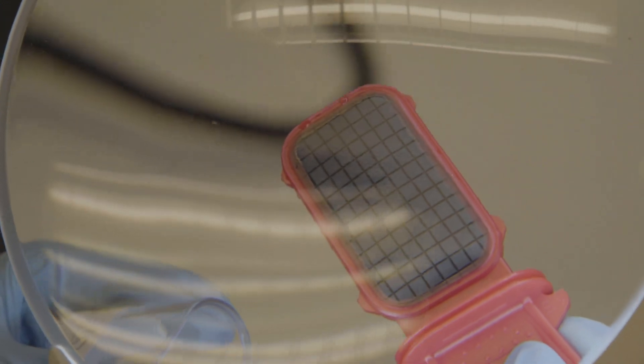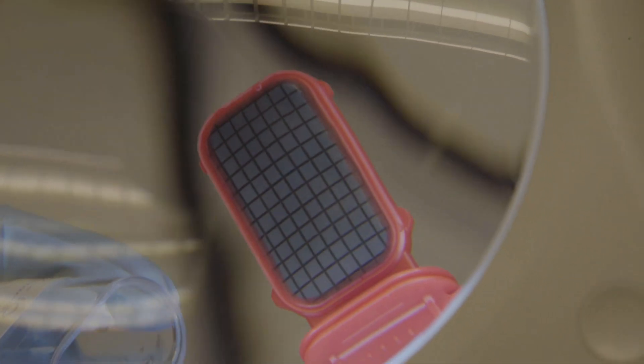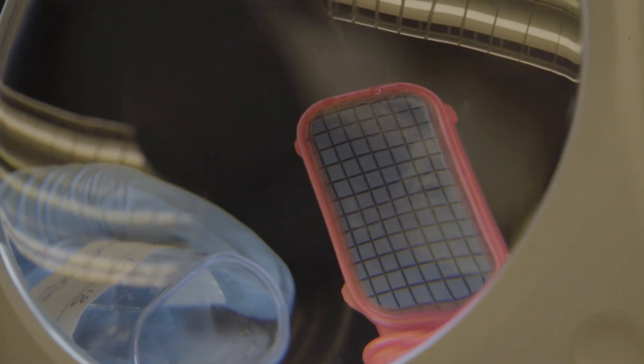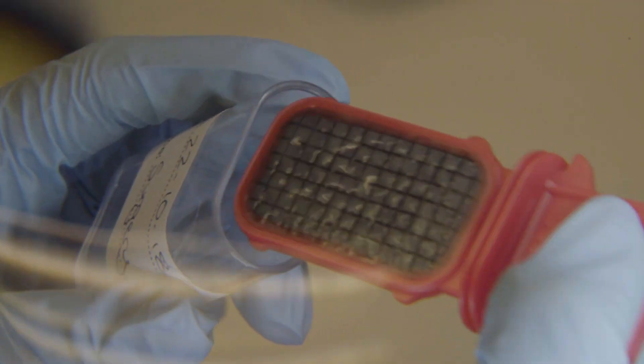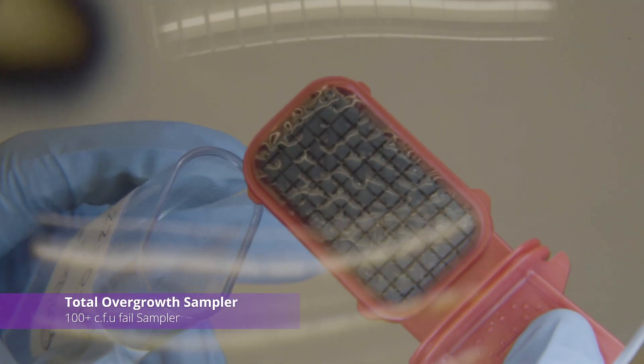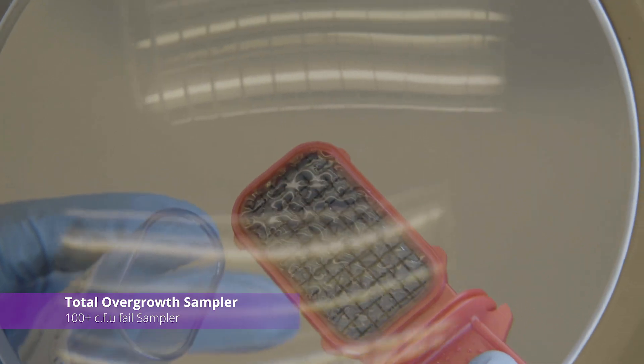In some cases, especially where no control measures have been in place, a complete overgrowth can occur. This uniform film of organisms can be mistaken for a no growth.